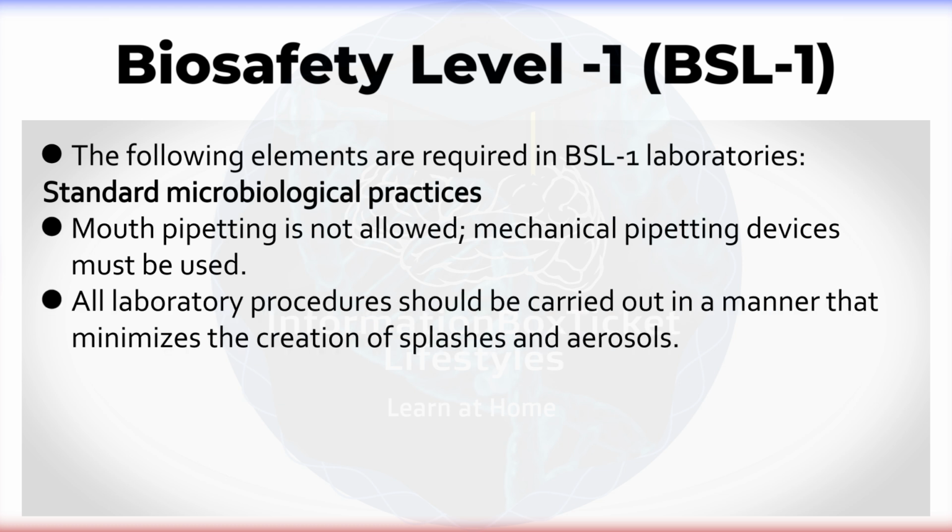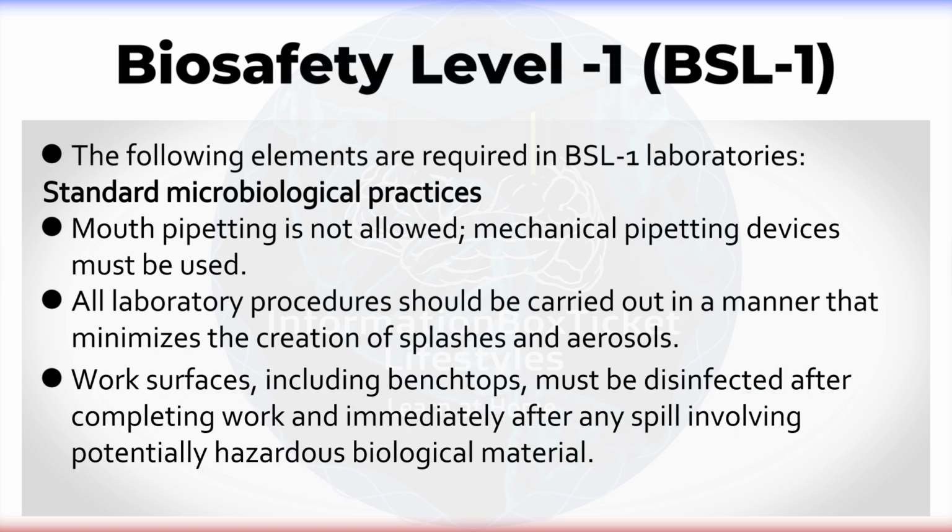All laboratory procedures should be carried out in a manner that minimizes the creation of splashes and aerosols. Work surfaces, including bench tops, must be disinfected after completing work and immediately after any spill involving potentially hazardous biological material.